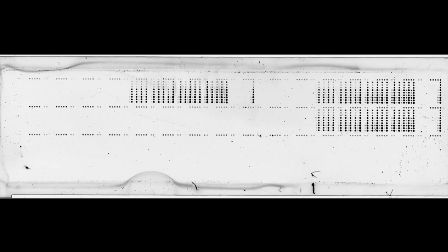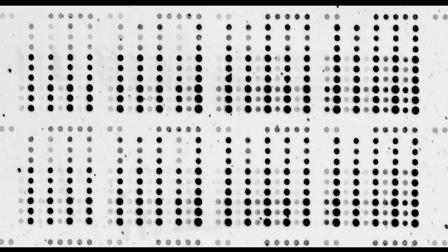Let's have also a zoom in and in black and white as before. So first in black and white, and we can also zoom in. And also here you can see the resolution is more than enough for quantification. So we can clearly see each protein spot and the different shades of gray you can see here, the different intensities. So quantification can be done really easily here.